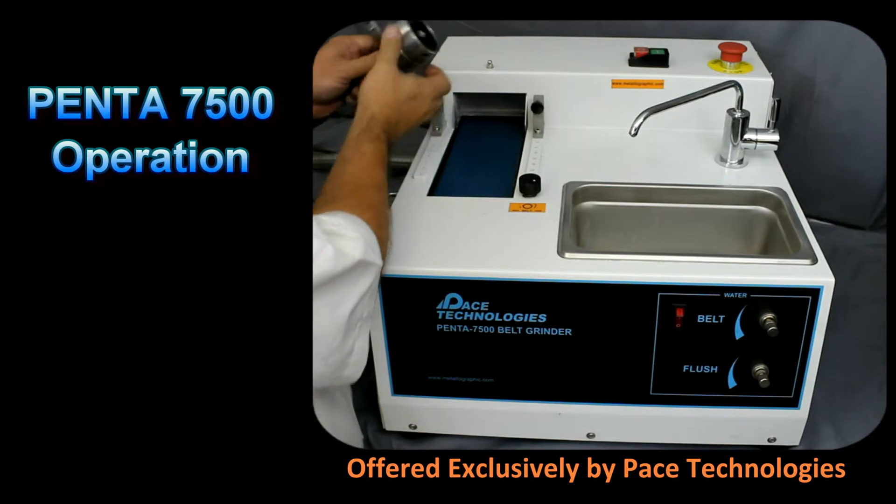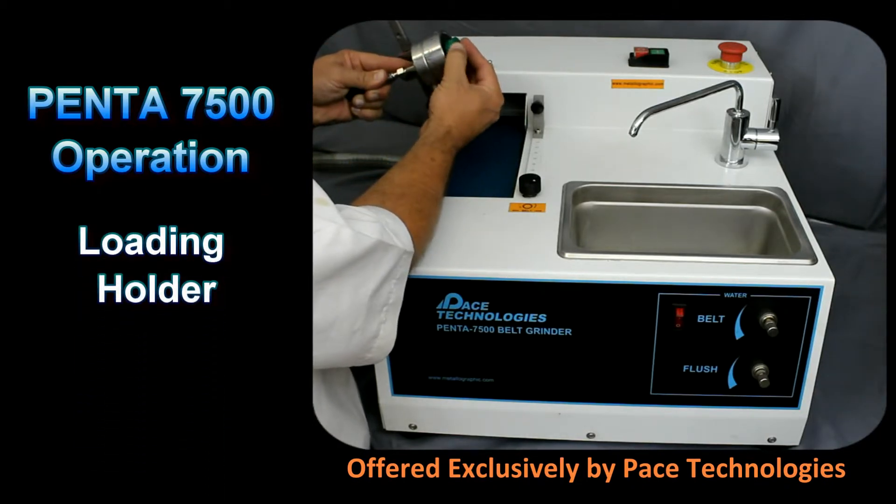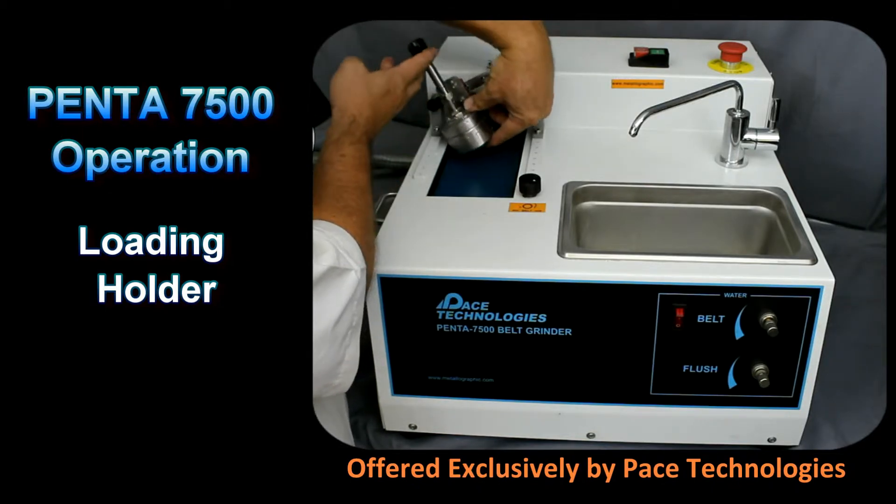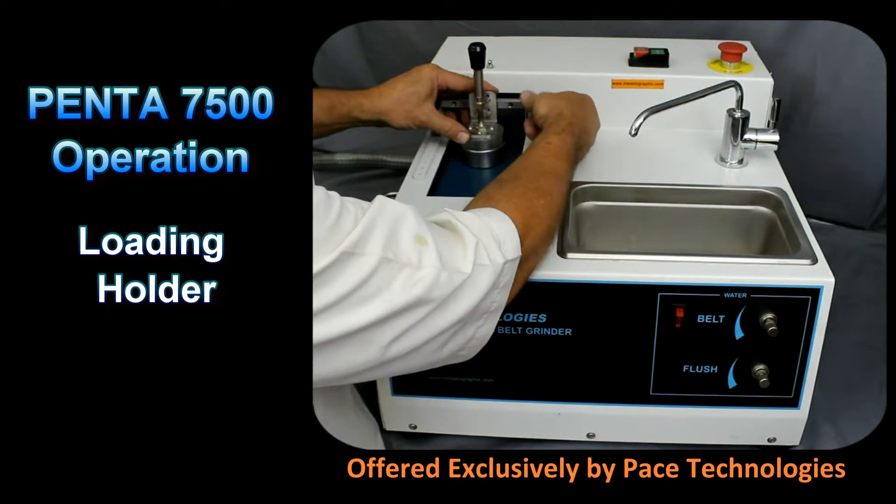Loading the mounted specimen in the fixture is very easy. Pull back on the spring and insert the mount into the holder. While holding the mount in place, swing the holder into position and then tighten the holding pin.